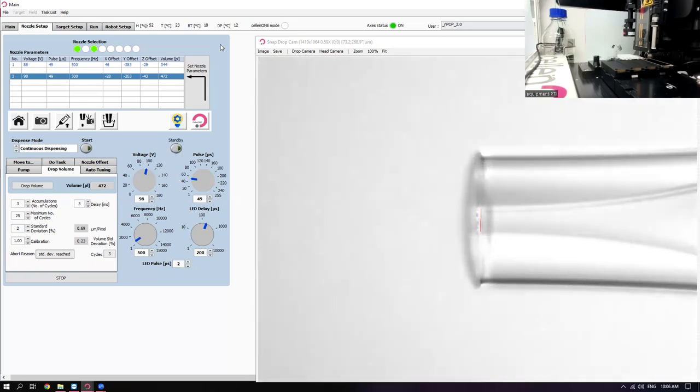We've got some syringe pumps in the back there. Those are for allowing us to aspirate sample and also flush the nozzle out. This is a system liquid. It has to be particle-free, deionized, degassed. Degassing allows us to absorb bubbles if there are bubbles present.